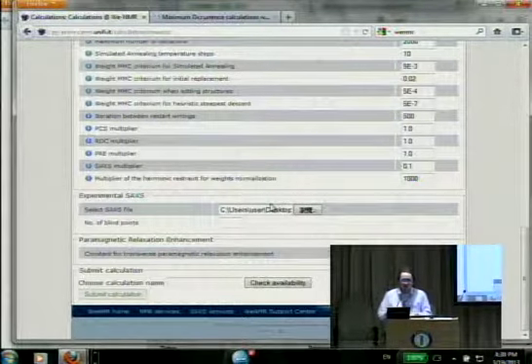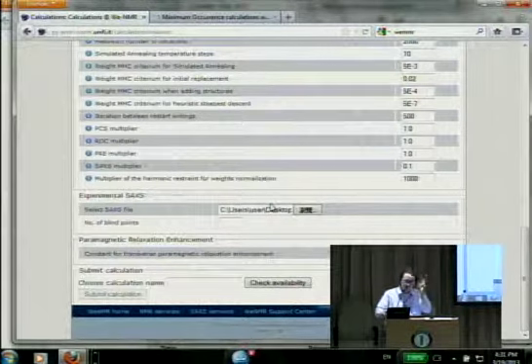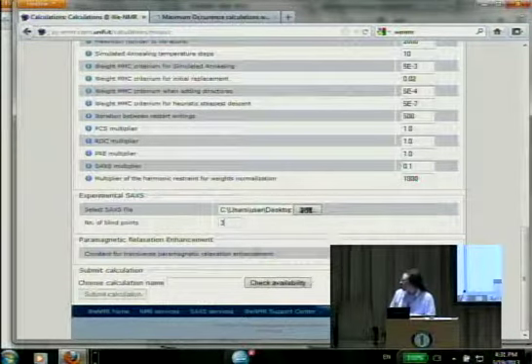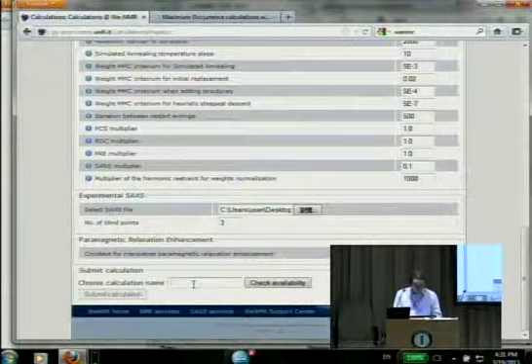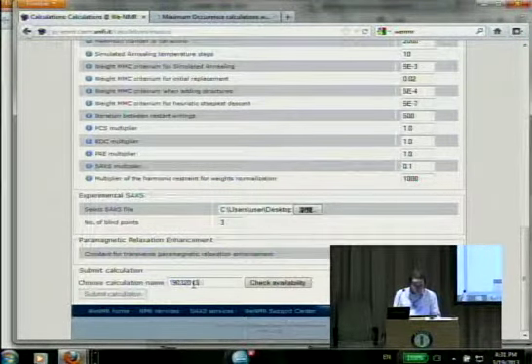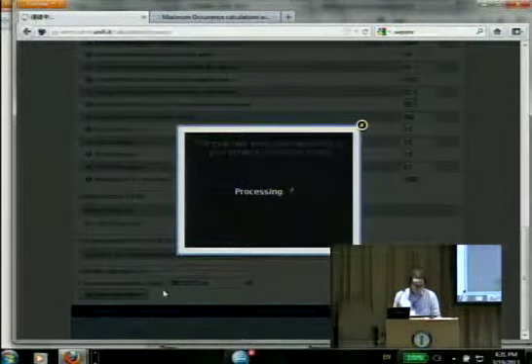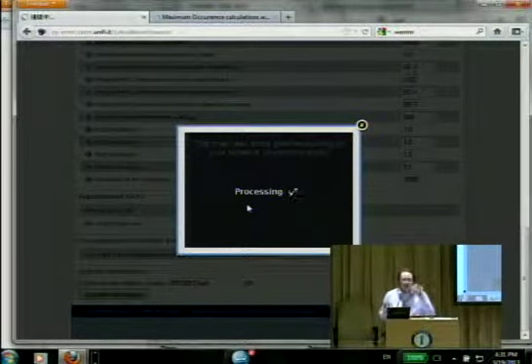And so that's again the same story. This is also a pretty long calculation because, well, now it's only 10 ensembles, so it's not so long actually, but if you are doing 300-400, each is taking on the order of an hour, so again it has to be split into several jobs. And it will look pretty much the same as before, as the first step. There's only one mother job, and you don't see all the daughter jobs.